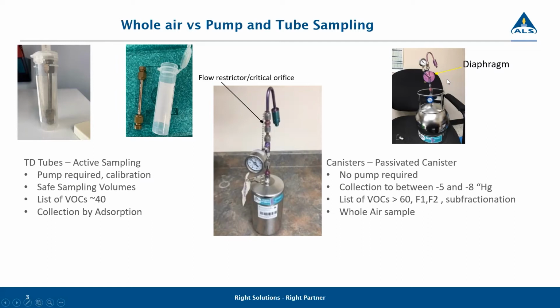And our digital calibrator goes to 2 decimal places. And why I'm saying that is that's relevant when you actually take your beginning and final vacuum pressures on your canisters. You're taking it just to the whole number, and you're using an analog vacuum gauge that we supply as an independent in every order, but you also have that independent vacuum gauge right attached to your flow controller. When we calibrate the flow controller, we're using a digital calibrator that goes to 0.01. So it actually is pretty specific.